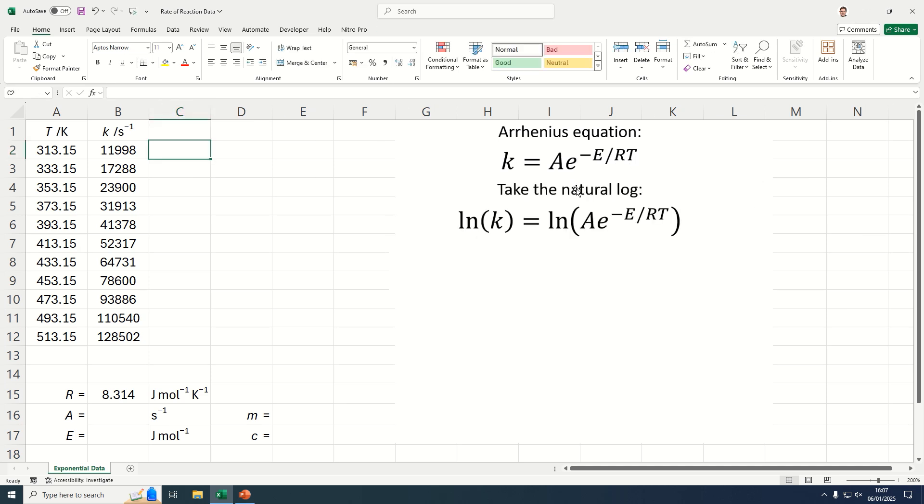So if we take the natural log of both sides we can simplify this using the properties of logs. So first of all we can break apart the two terms that are multiplied together and just add them up.